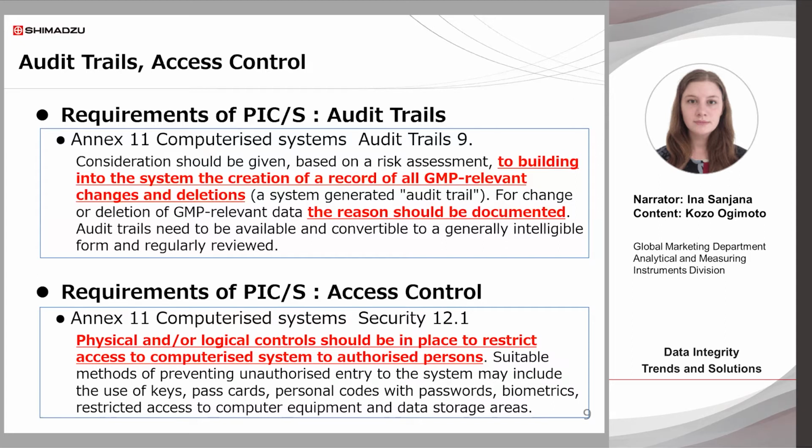For example, staff whose main role is routine analysis via predetermined methods should have their access restricted to prevent a reanalysis, which may have a large effect on results. On the other hand, if there is a problem with the data, a manager may have to access and analyze the data. Permission to access or analyze data should therefore be managed for each user.